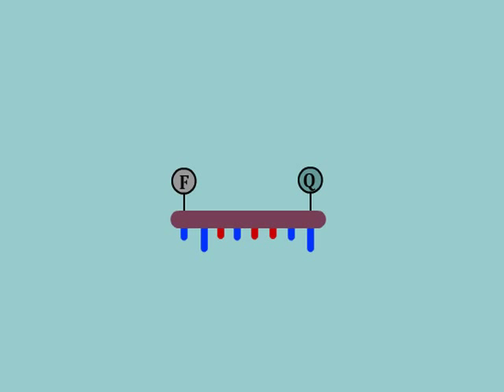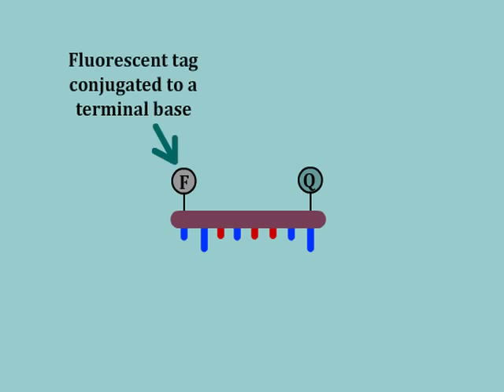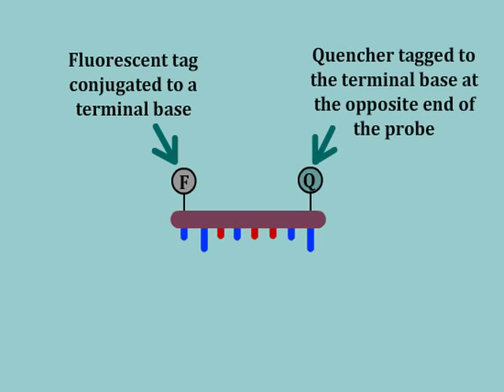However, unlike the primers, this probe is modified in a special way. One of its nucleotides is labeled covalently with a fluorescent molecule, and another nucleotide is labeled with a fluorescence quenching molecule. The quencher rapidly absorbs any light energy emitted by the fluorescence molecule as long as it remains in close proximity.